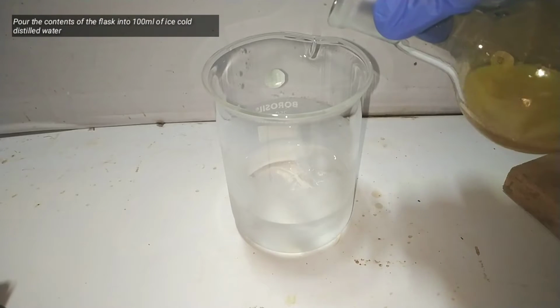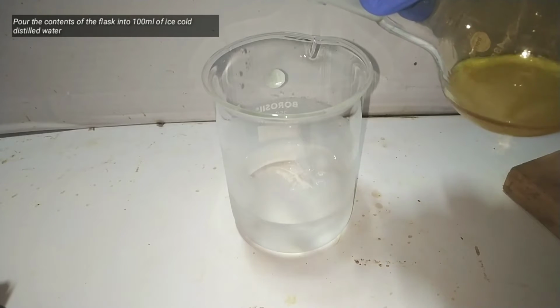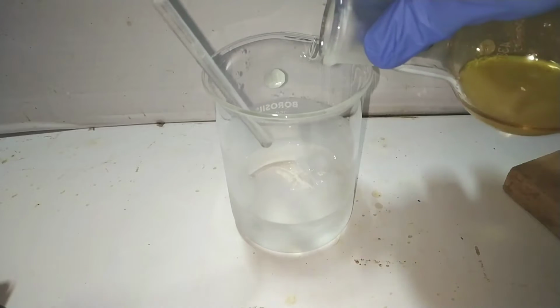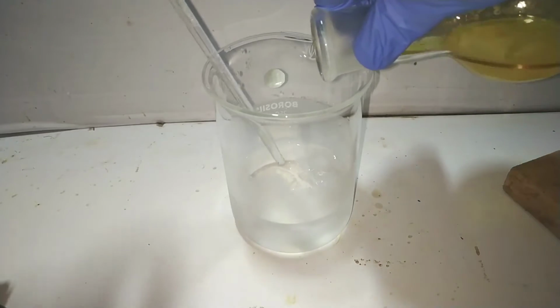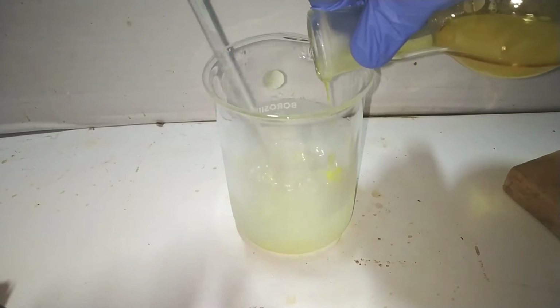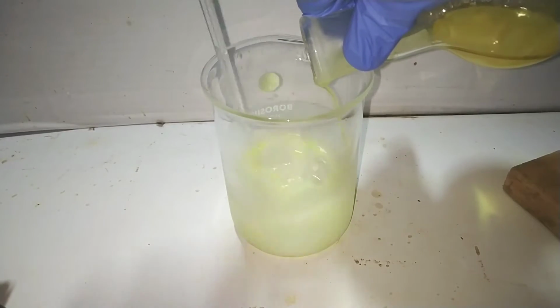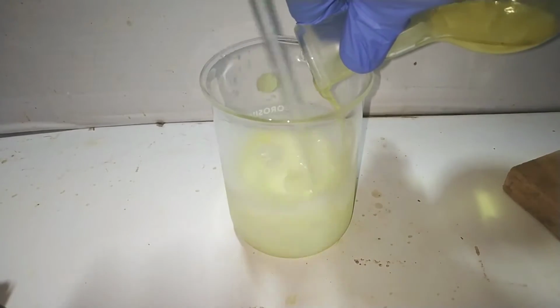After taking it out from the water bath, transfer the contents to about 100 milliliters of ice cold distilled water taken in a beaker. We have to add the solution from the flask with constant stirring, and this will separate out the crude Benzil as a yellow colored solid.